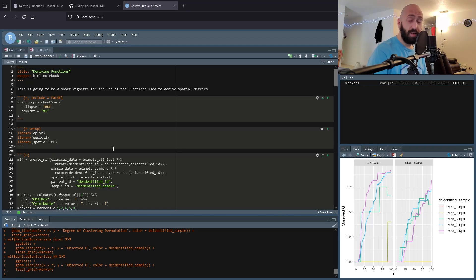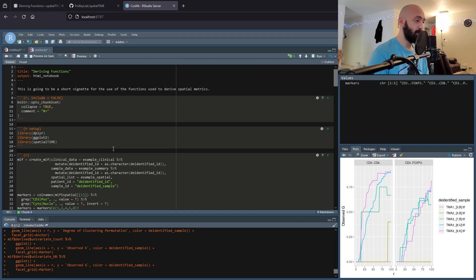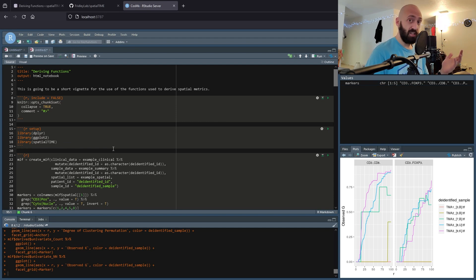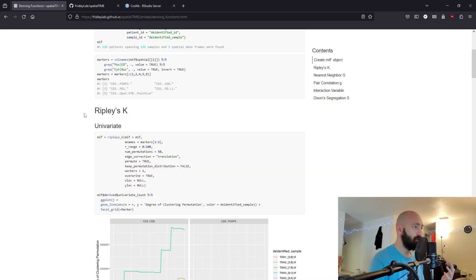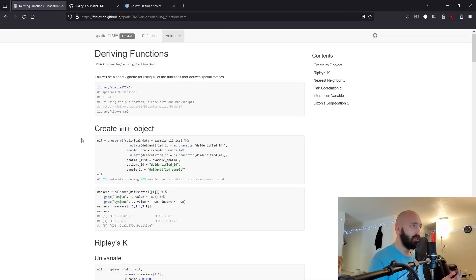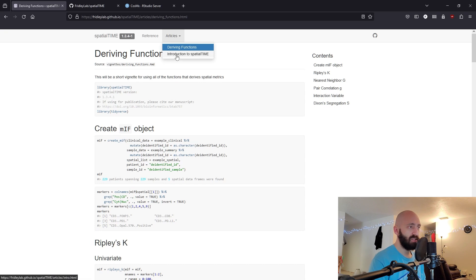Welcome back everybody. Today we're going over some of the clustering metrics I mentioned in the spatial transcriptomics video. The one we used was the nearest neighbor G, but there are a couple of others. If we go to the spatialTIME package page on GitHub.io, we can see there are a couple of vignettes — the introduction and the deriving functions.